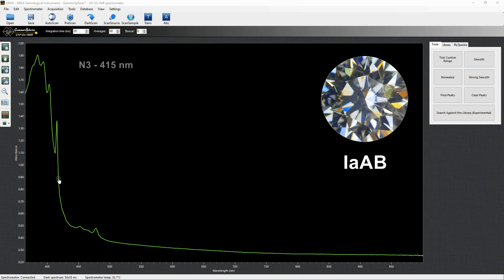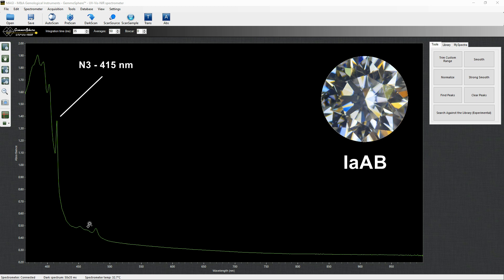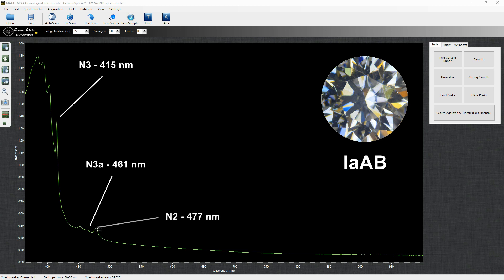The most known is the N3 aggregate which is responsible for the blue fluorescence and can be identified as an absorption peak at 415 nm. Other features related to this defect are the N3A center at 461 nm and the N2 center at 477 nm.